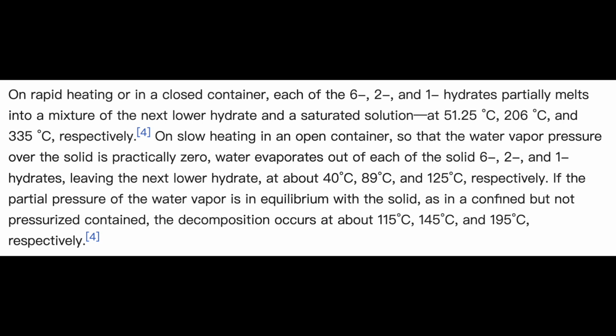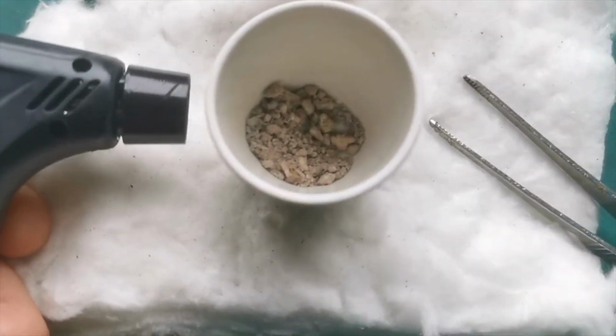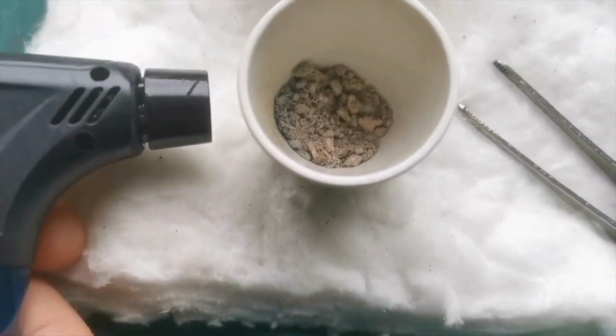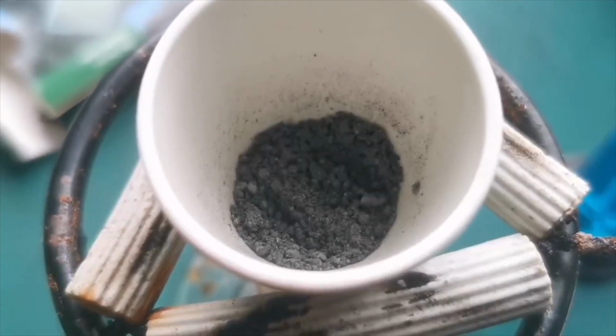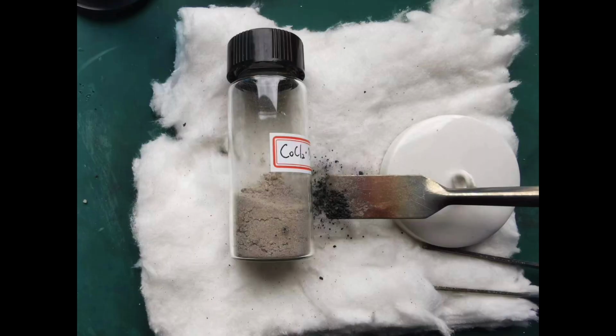I did some research and found out that the first 5 water molecules are relatively easy to kick off, but the last one really requires some strong heating that my hot plate cannot reach. I added a small sample of my product in a crucible and heated it with my blowtorch. The color darkens significantly and turns to a blue-black color. I then processed all of my products this way. Upon comparing the two samples, you can clearly see their color difference.